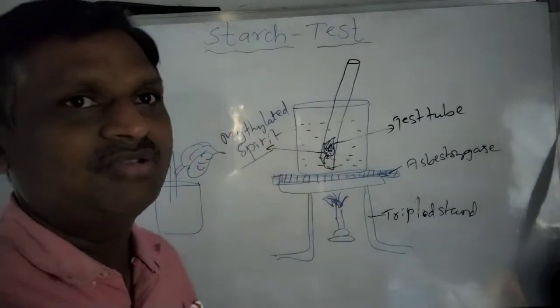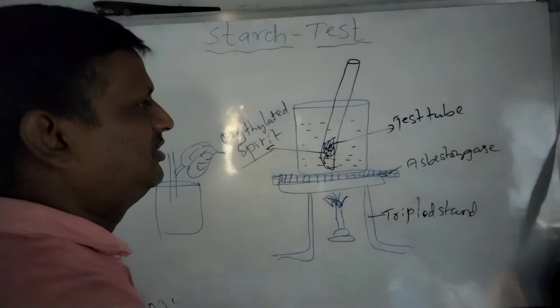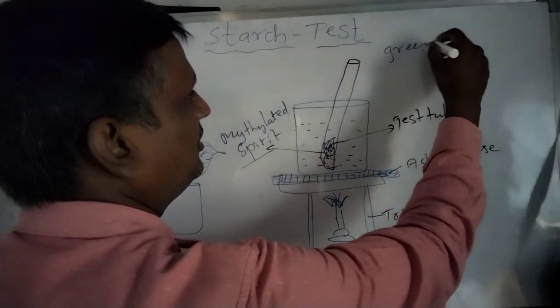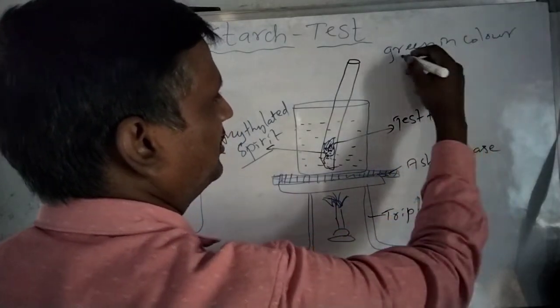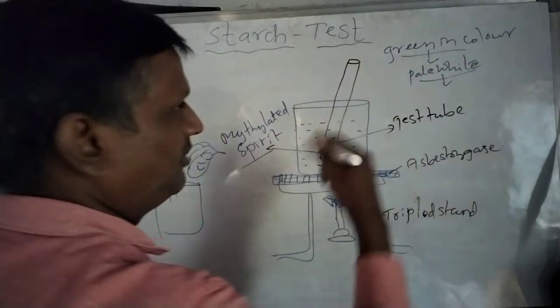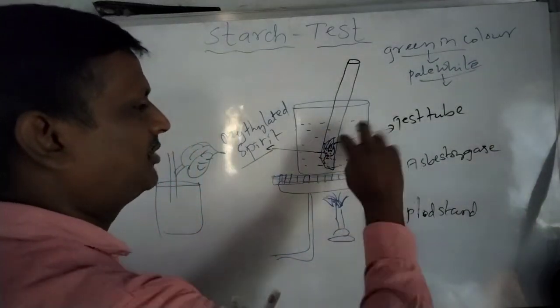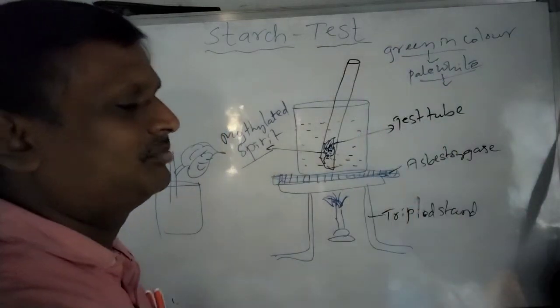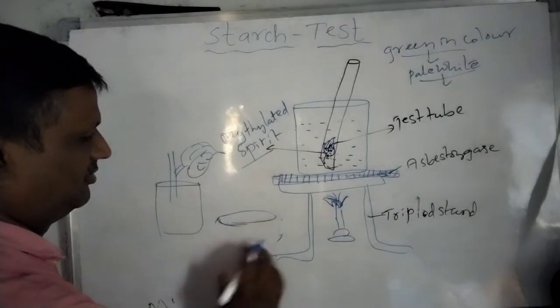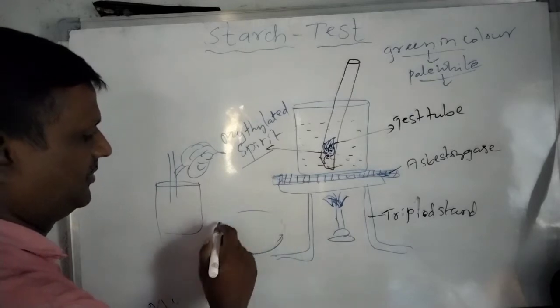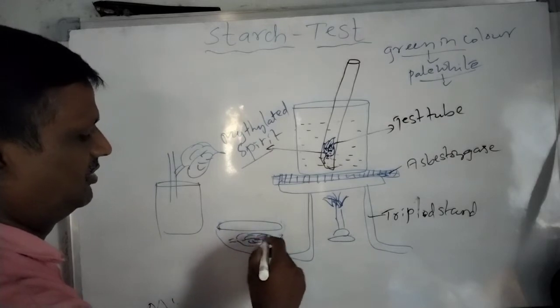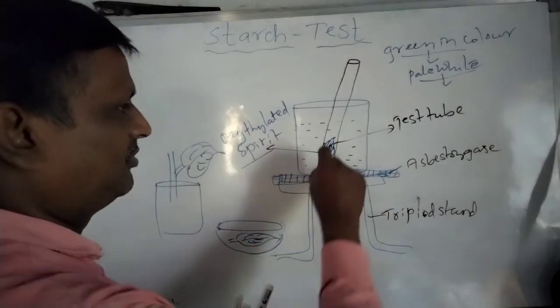The leaf is boiled again for some more time in the methylated spirit. After some time, we can observe that the green color leaf turns into pale white in color. When the leaf turns pale white, it should be carefully taken out with the help of a brush and spread on a petri dish.